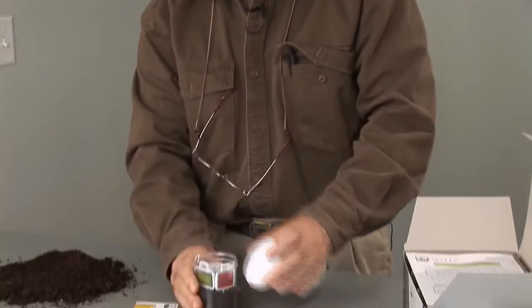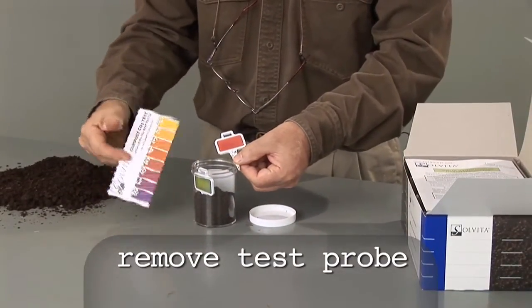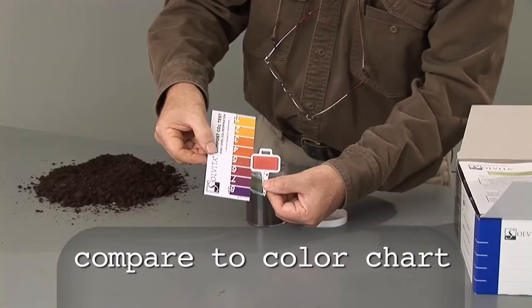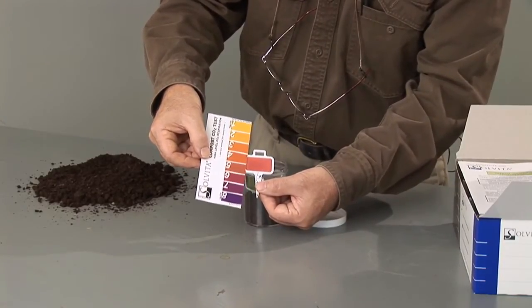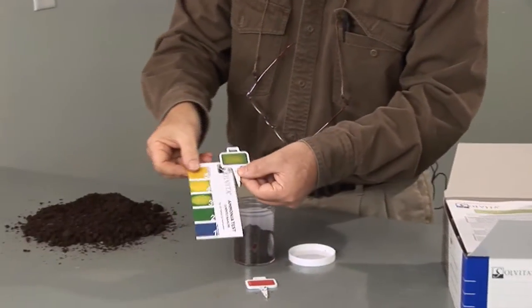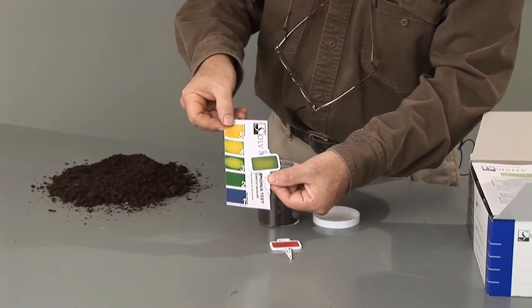Now we open the jar and remove each test paddle, first the carbon dioxide one. Attempt to line the color up with the match on the color chart — here you can see it's a pretty good match with somewhere between a four and a five. Now we take out the ammonia test paddle, turn over the color chart, and we see it's somewhere close to a three.